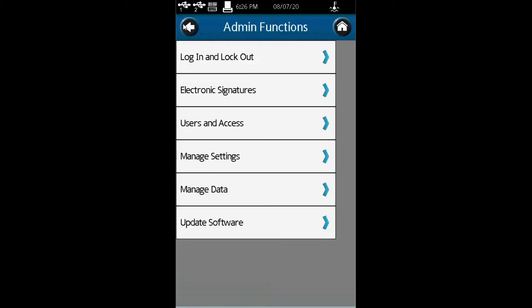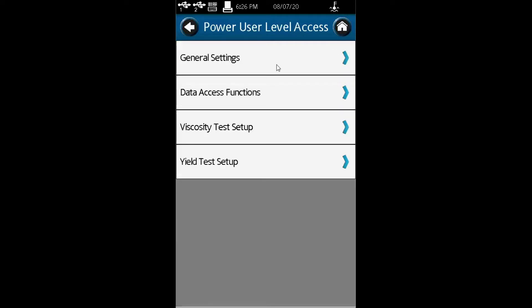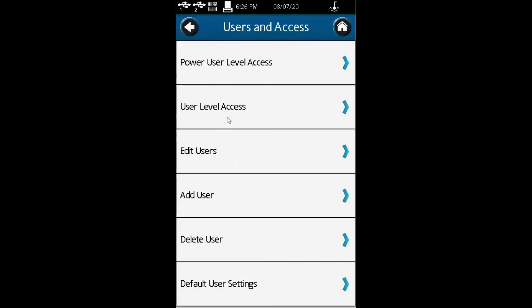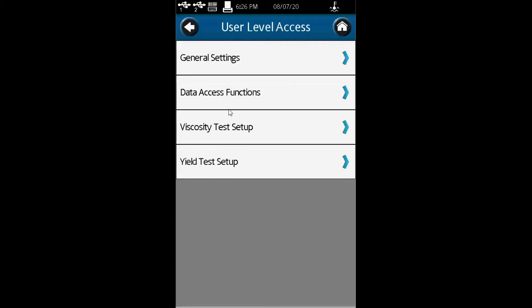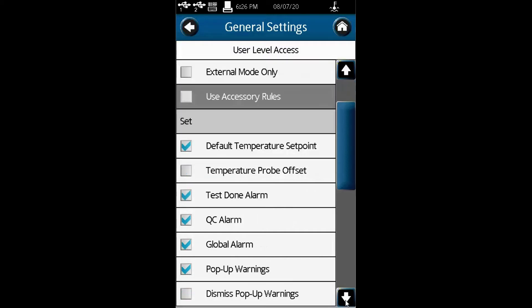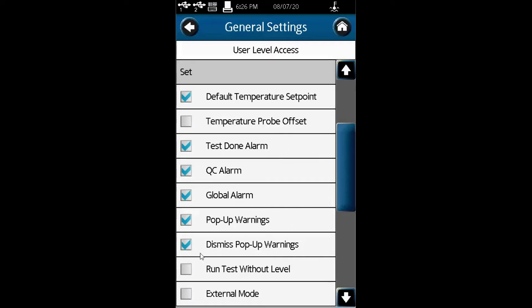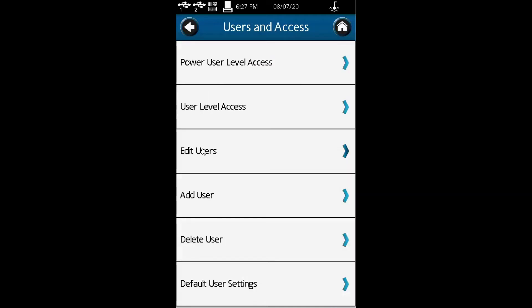The other function is users and access. Here you can assign power user levels, where you can do everything, or a user level access. In general settings, you can control access to the viscometer, the QC alarm, and things like that, whether to give access for standalone or external mode.